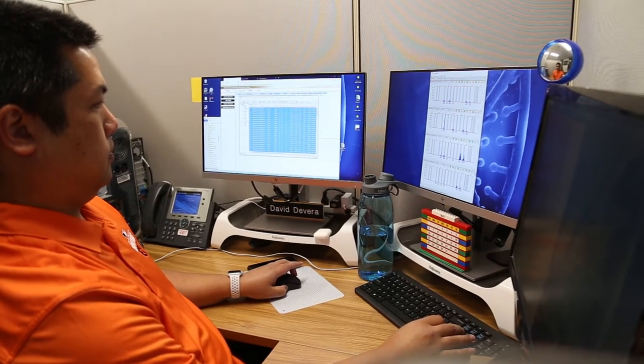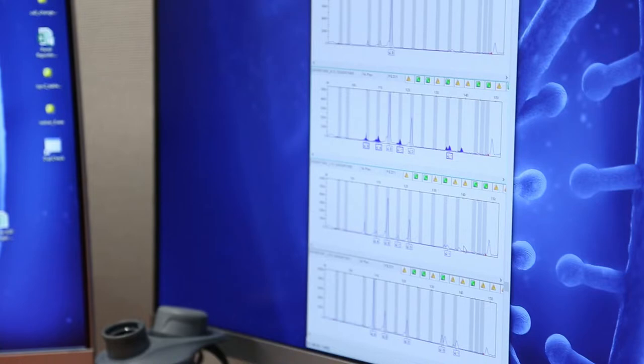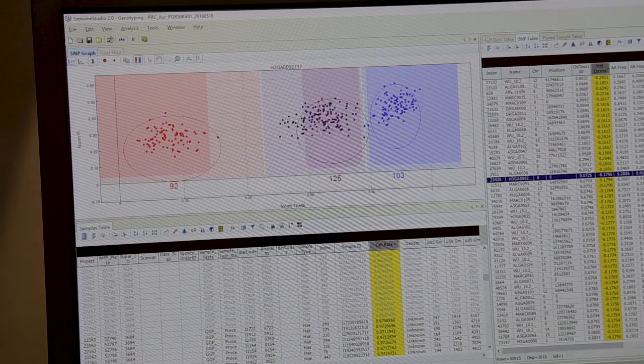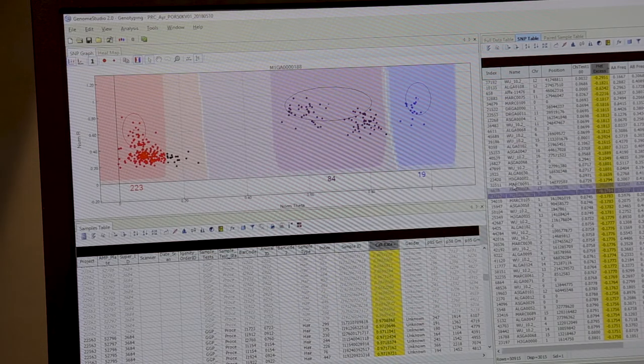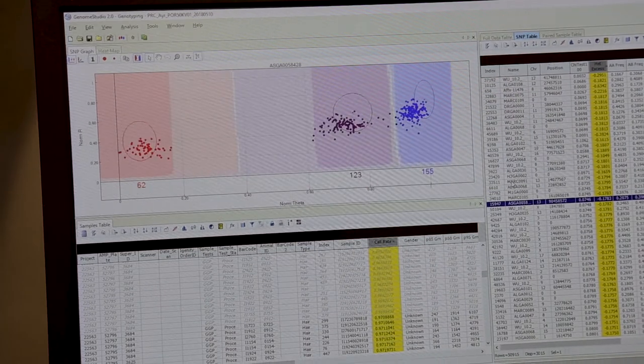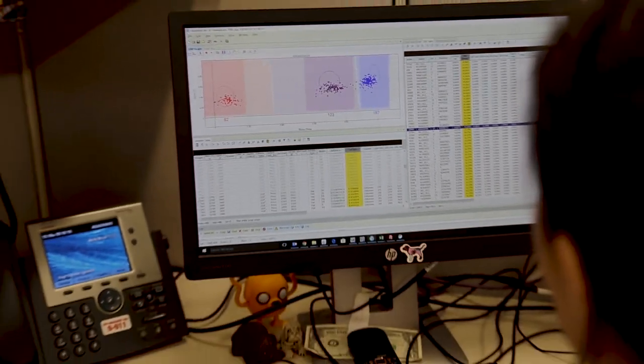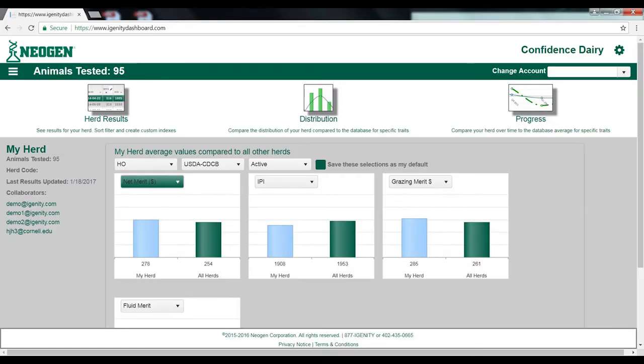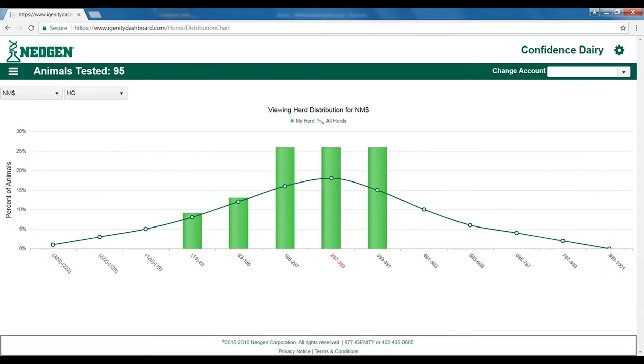Our final stage involves analyzing the data generated from the DNA instruments. We carefully examine the results from the various scanners and employ complex math formulas to interpret the raw DNA. After careful analysis and quality control, we report the data to our customers.